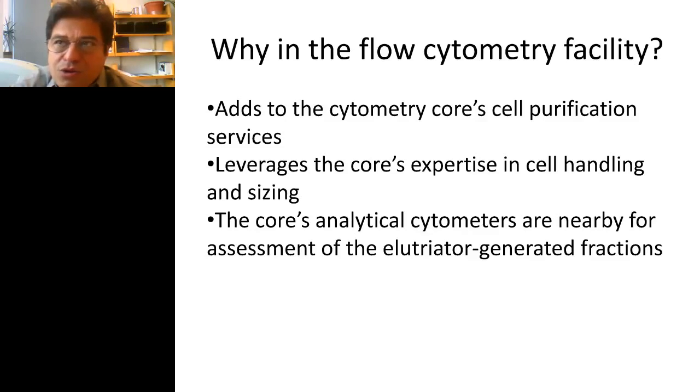The notion of a core laboratory can broaden this so that elutriation is not used just for one application. It could be used for many applications. Having it in a core, and specifically a flow cytometry facility, is where the expertise in configuring an instrument like an elutriator for a number of applications is, and there are a lot of applications that we'll talk about briefly. A flow cytometry facility has to deal with cells because of the cell purification services that they offer. So it seems like a logical place for something like an elutriator.